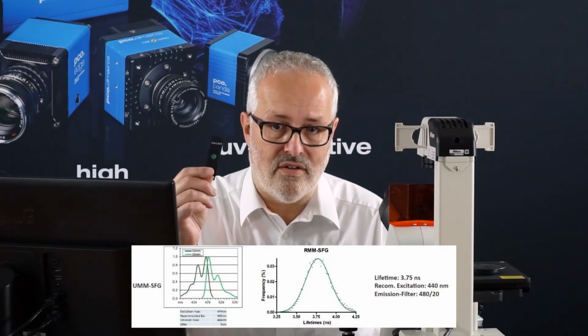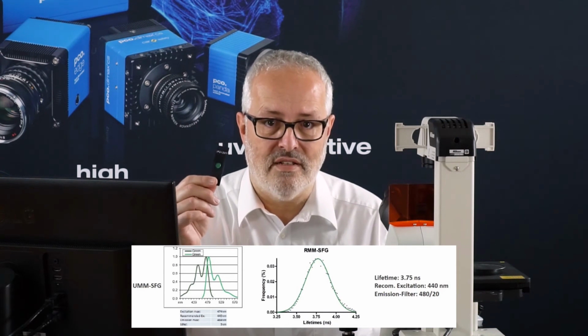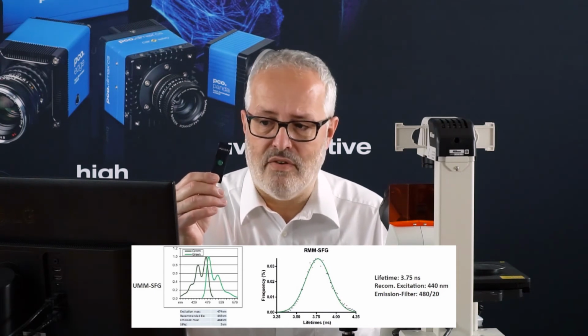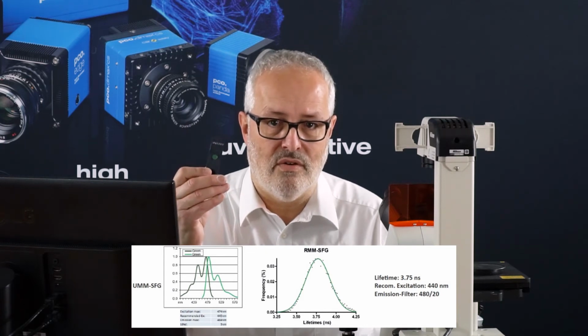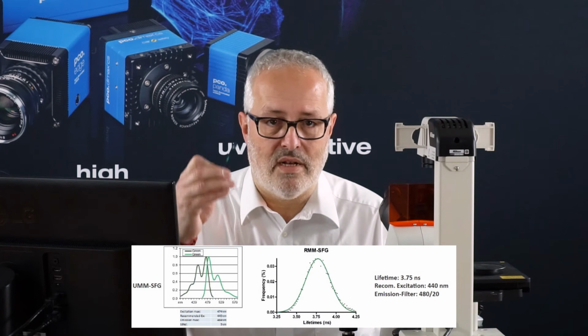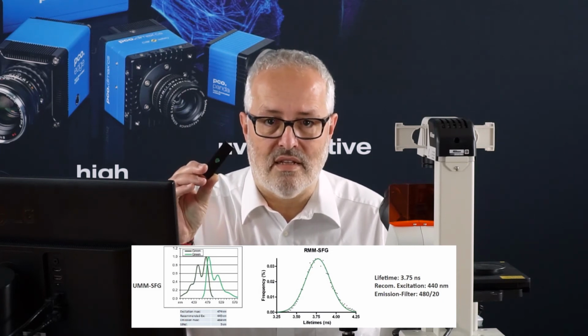For our purpose, we are using these reference standards from a company named Starna Scientific in England, which are very convenient because the fluorophores are inbuilt within a plastic window, and we can use these metal slides which have the same size like a standard glass slide.